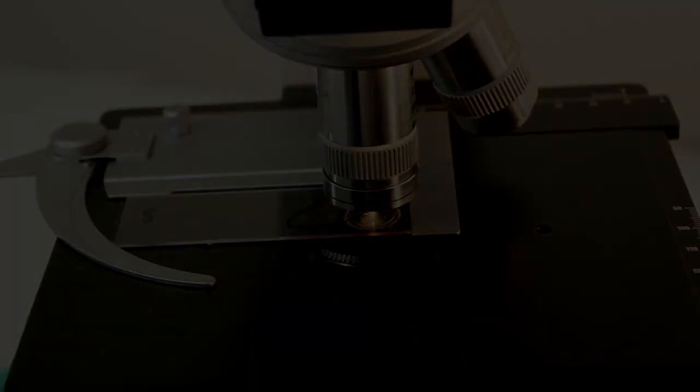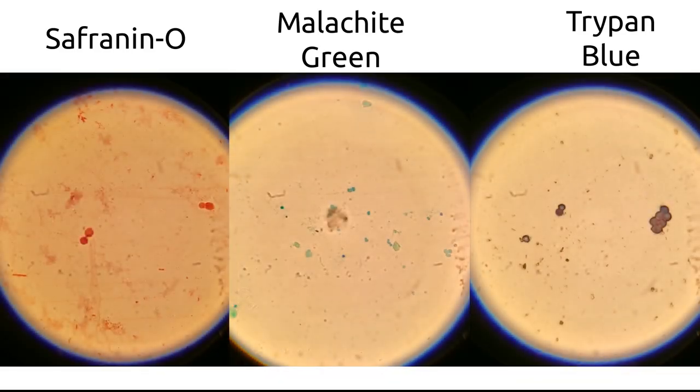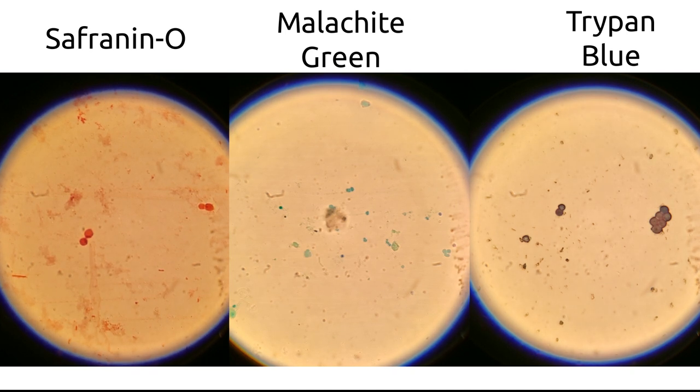So here's an example of the same yeast sample stained with saffranin, with malachite green, and with trypan blue. As you can see, these stain cells to a different extent and to a different intensity, but they all allow you to more easily see the cell shape, as well as smaller objects like bacteria. With high magnification, like the 1000x I'm showing you here, you should easily be able to make out major morphological features, patterns of cell division, and other important microbiological features that can help you track and identify what's present in your samples.